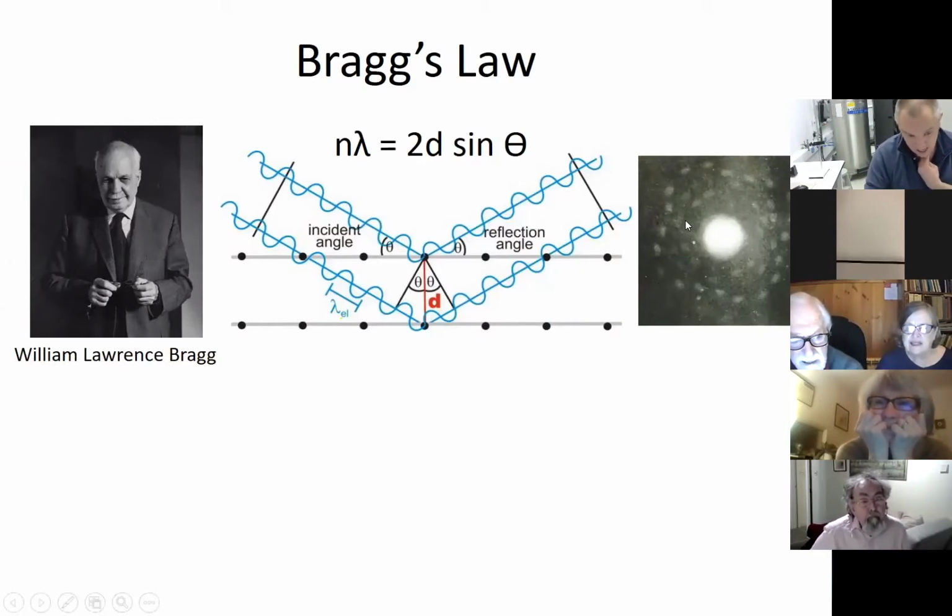What Bragg worked out was that he could use the spacing between these spots to work out the distance between the planes of atoms in his crystal. And so it was that realization that allowed him to work out the structure of this simple molecule.